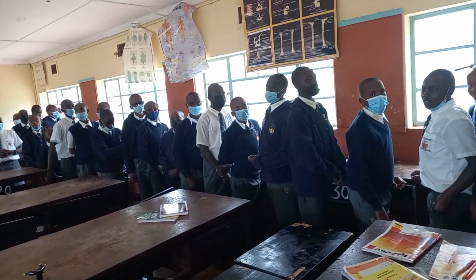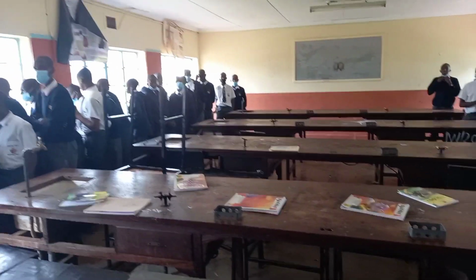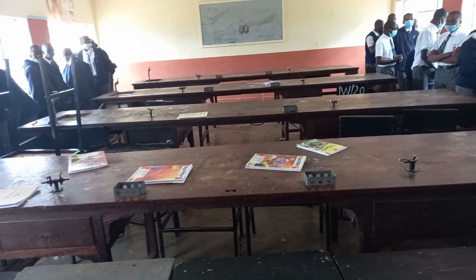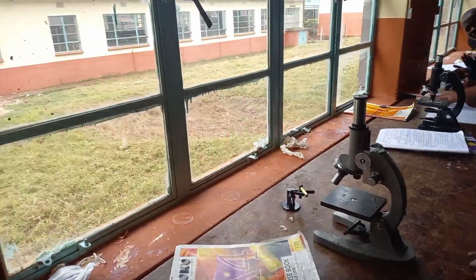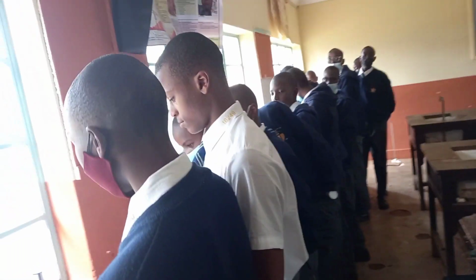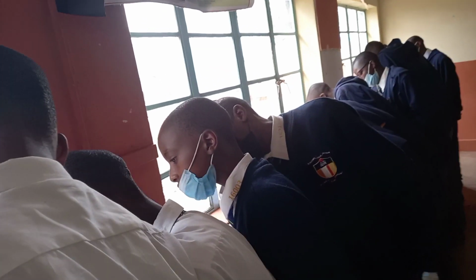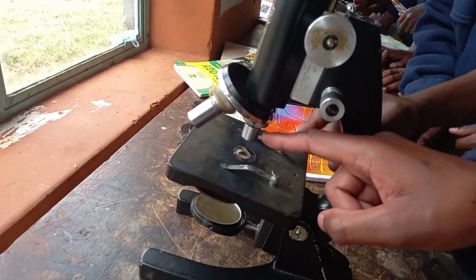Good afternoon. All right, so today we are in Biolab 2. And what are we doing today? How to use a microscope. So I see you're set on the side benches where there is light passing through the window. The first procedure: you place the microscope on the bench with the stage facing away from you. Correct. So in your direction, your window. Turn the low power objective lens until it clicks into position with the eyepiece. Have you finished? Yes. Show the low power. How do you know it's the low power?